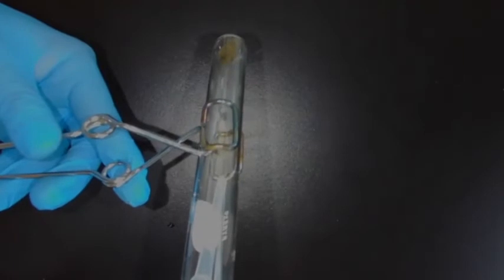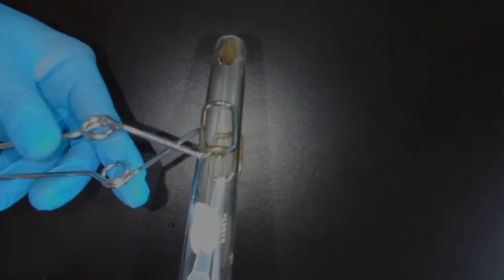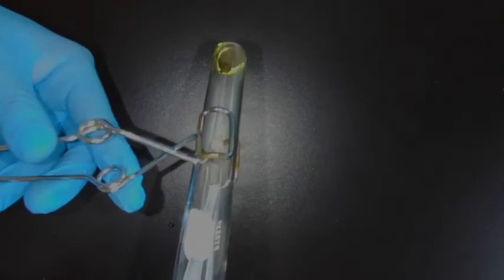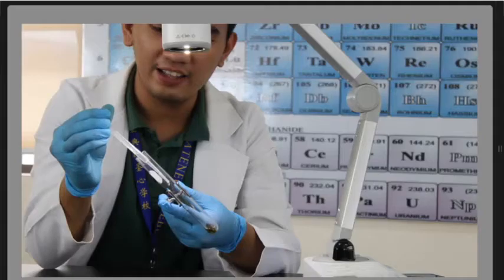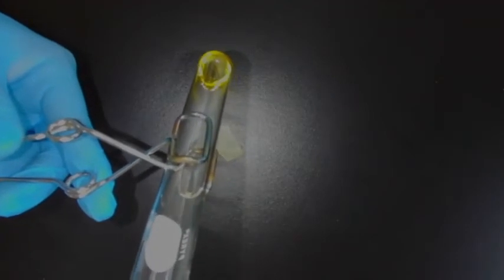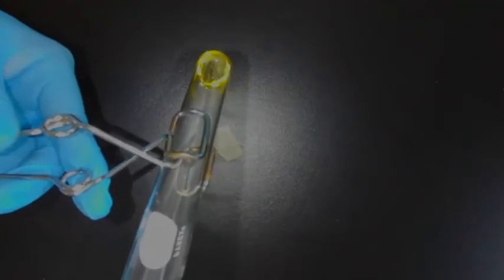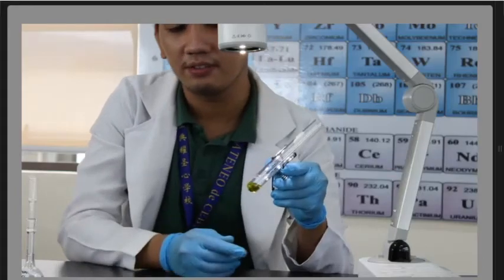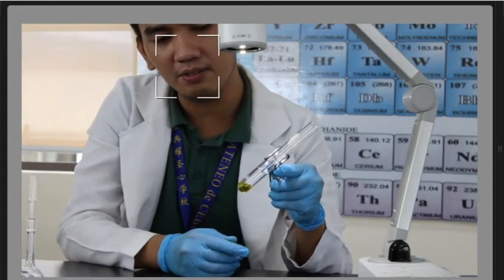Okay, so 1, 2, 3, 4, 5, 6, 7, 8, 9, 10, 11, 12, 13, 14, 15, 16, 17, 18. So notice the color of the reaction. What happened to the iron sulfide?